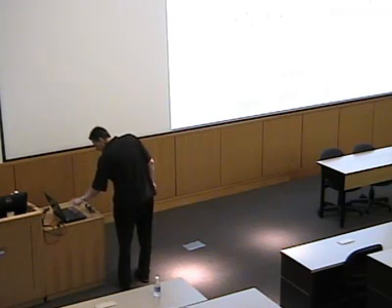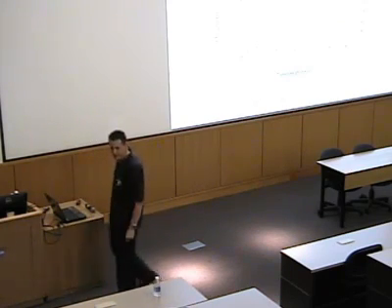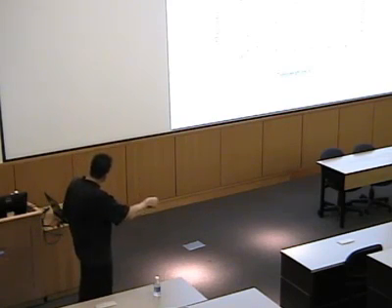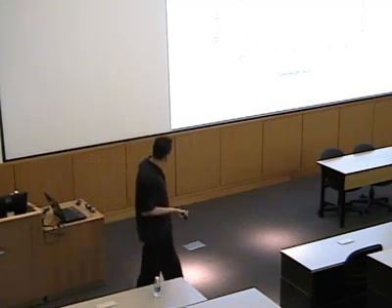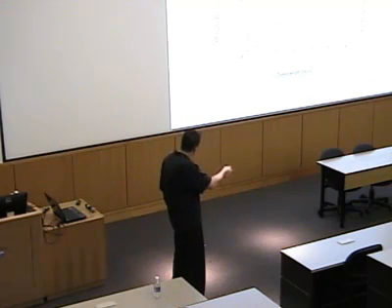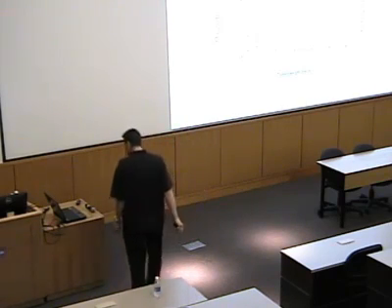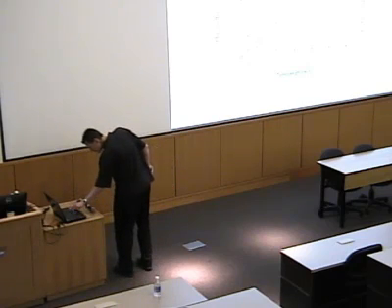So if we just look at the Curie law, just as a reminder, right? If we plot magnetic susceptibility against temperature, we get this 1 over T behavior. And so the C term intensity will behave in a similar way, just fundamentally because it has the same overall setup as the Curie law. So we'll get back to this in a little bit.